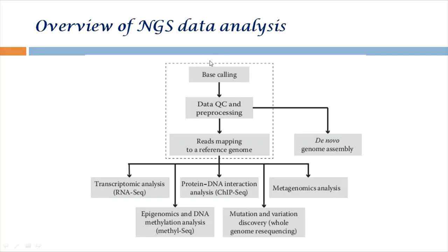You don't have to do anything about them, but you should have an understanding of what the procedure is and how you get the quality scores. Followed by this, you have a few million reads, each of the reads having corresponding bases and associated quality scores. Followed by that, you'll have to do data quality control and pre-processing. I'll explain what they are in the coming slides.